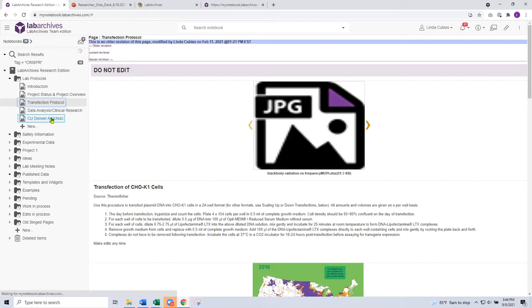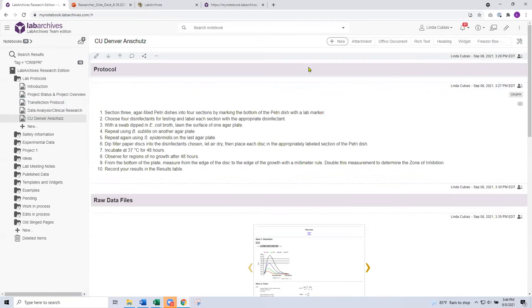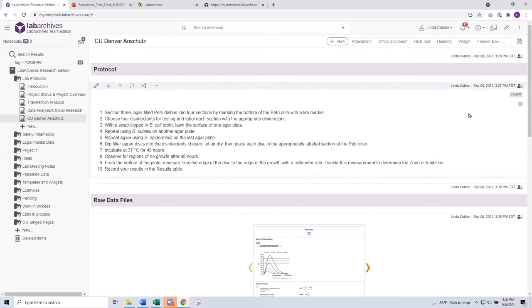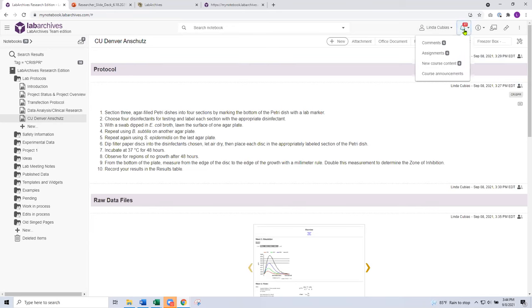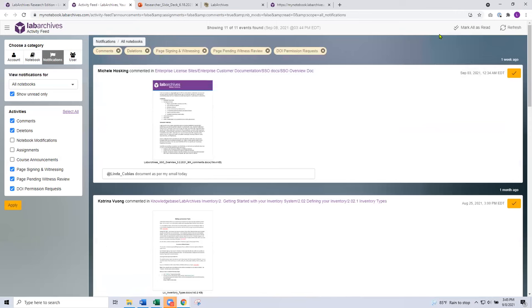A little bit more about managing data, and then we're going to talk about inviting people to the notebook and pass it over to Elliot. The bell icon is our activity feed — a great place for PIs, project managers, project leads, and lab supervisors to go for a quick look at recent activity. What's gone on in the notebook lately? Who's been in or who hasn't been in? What have they added? The activity feed gives you different categories and activities to sort on.